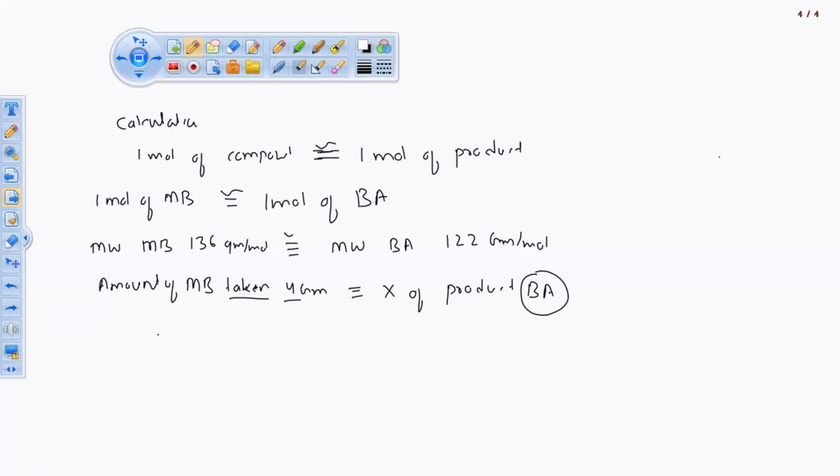Now we are having this molecular weight, we are having this molecular weight. Now we are going to keep the x as a constant to get our theoretical yield. Then how much we have taken? This one is 4 gram. 4 gram of reactant what we have taken multiplied by benzoic acid. कितना बनेगा अपना benzoic acid बनेगा 122. ठीक है. डिवाइडेड बाय अपना प्रोडक्ट कितना बनेगा भाई? अपना प्रोडक्ट है 122. ये कितना मॉलिकुलर वेट है इसका? 136. सो ये अपना थियोरेटिकल yield.